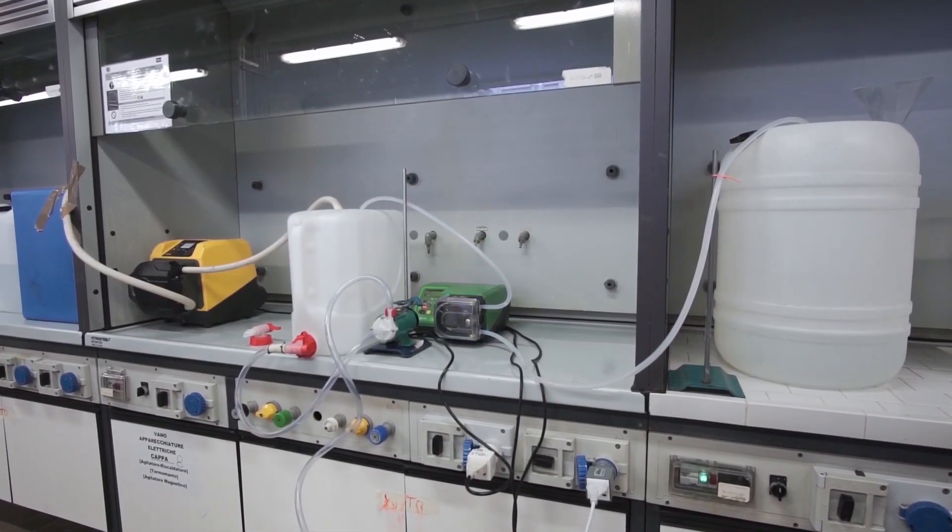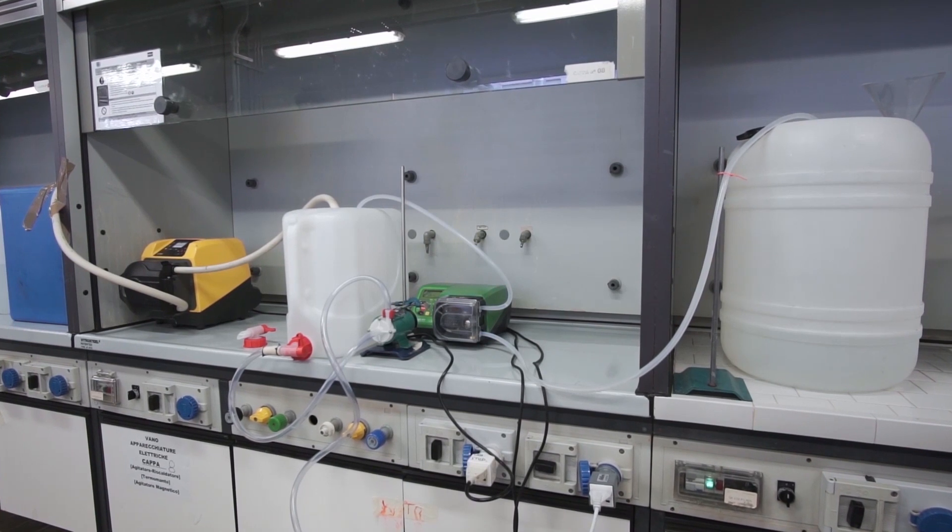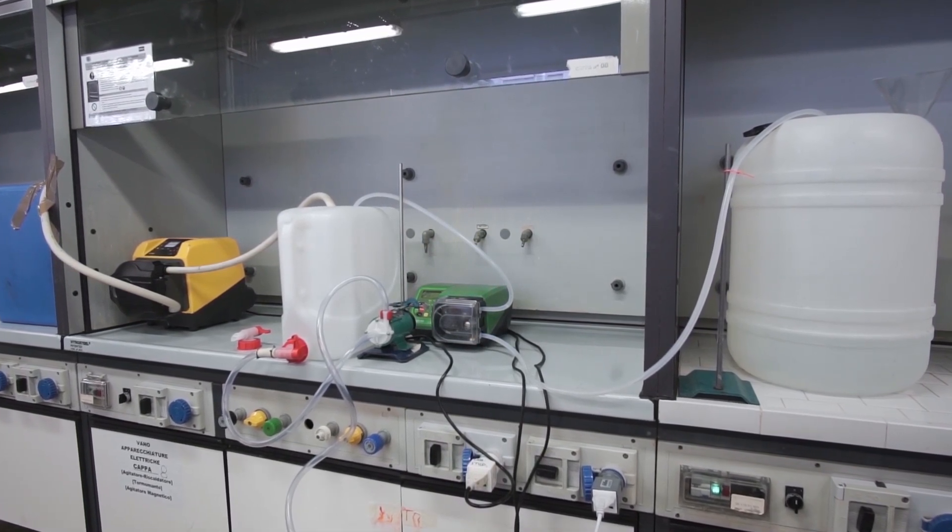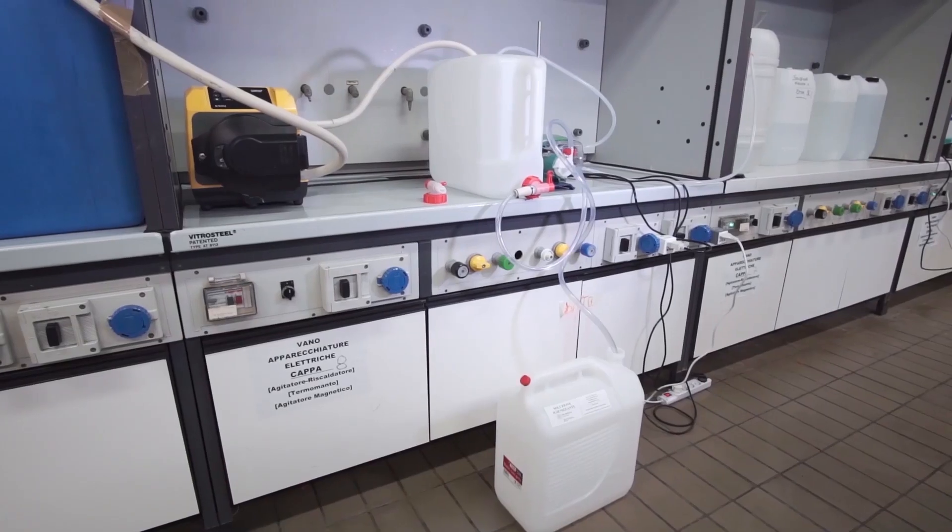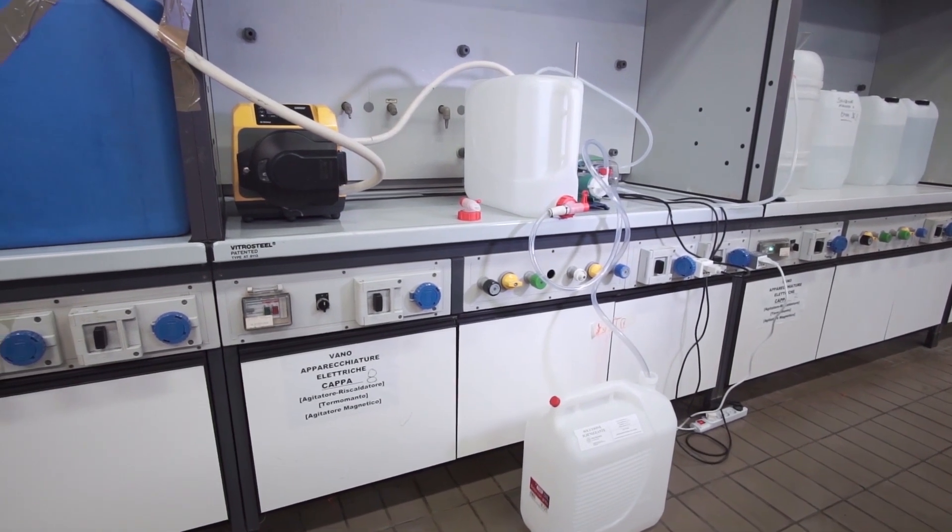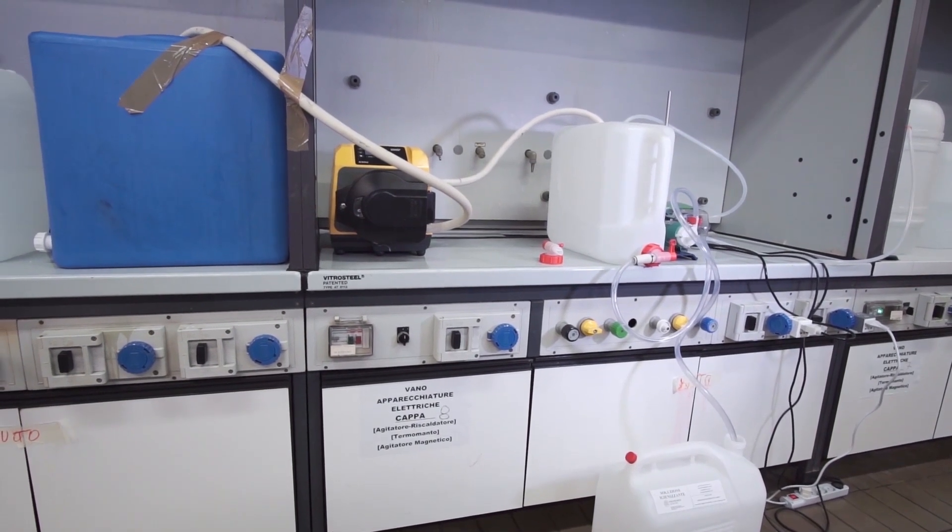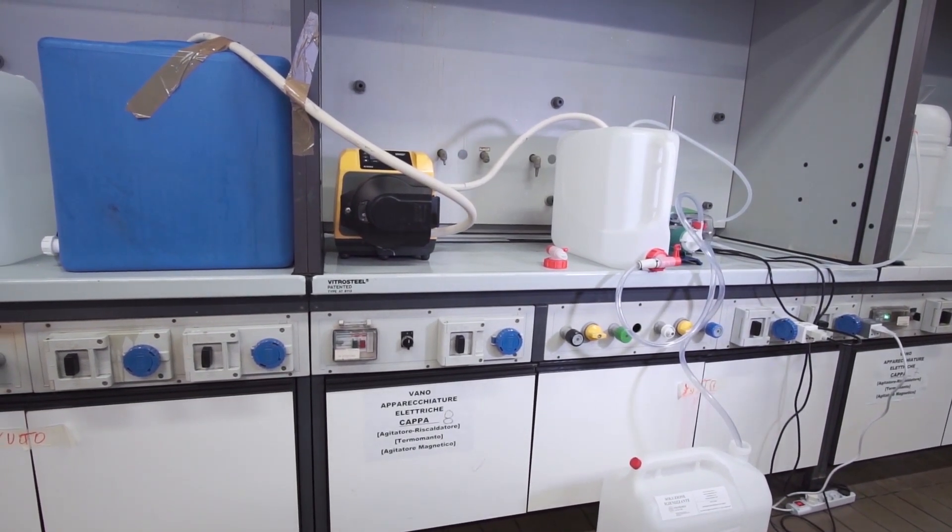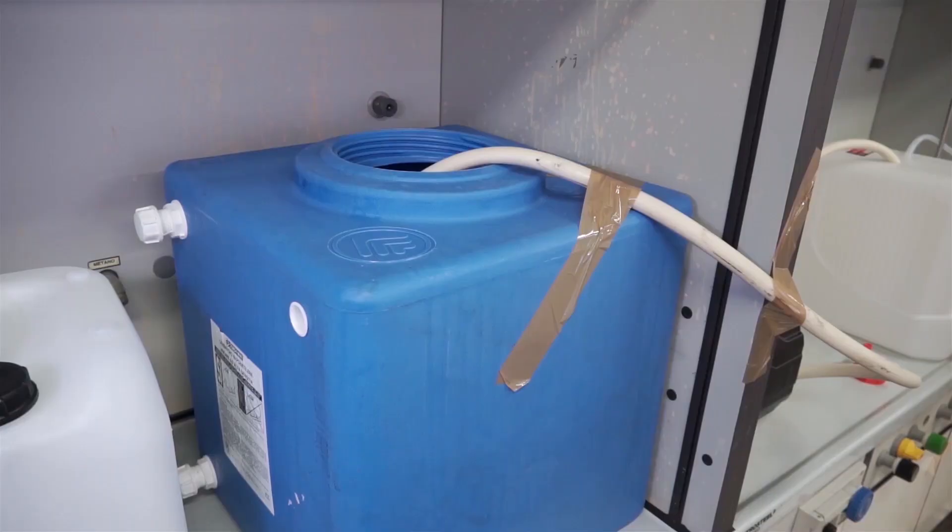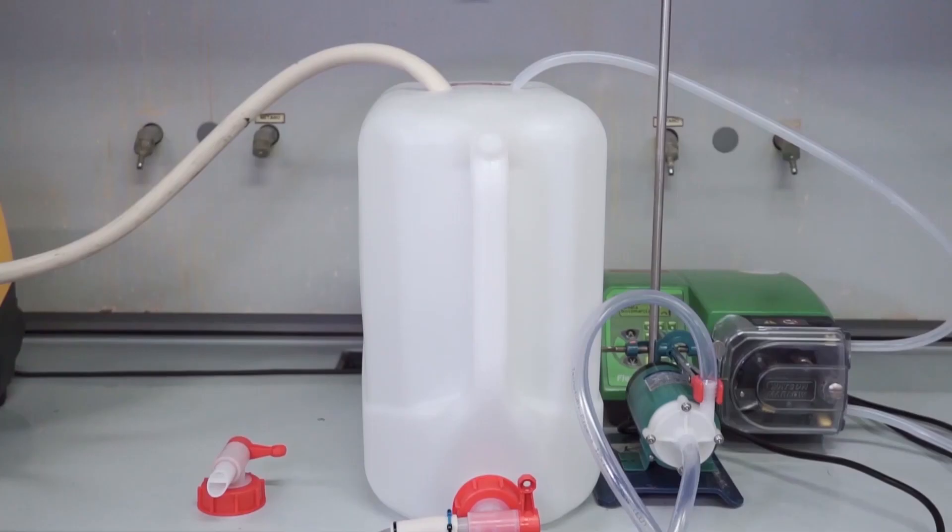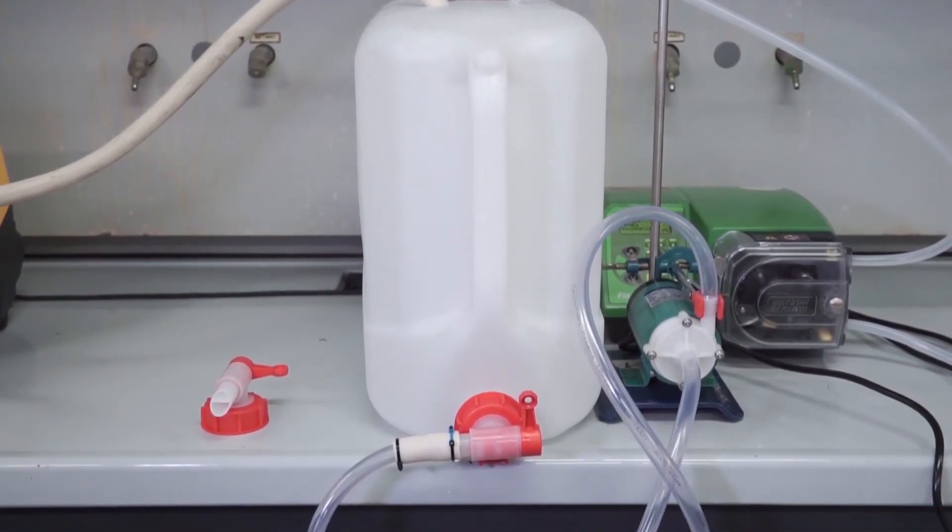A continuous process allows the reduction of the working volumes, providing a safer environment given the diminishing of flammable and explosive vapors. Additionally, it ensures higher productivity and a more versatile packaging. This configuration requires two storage tanks, two pumps, and a mixing tank with an exit for product recovery.